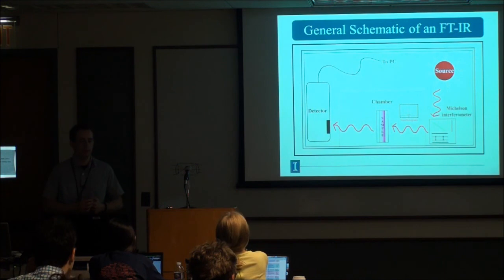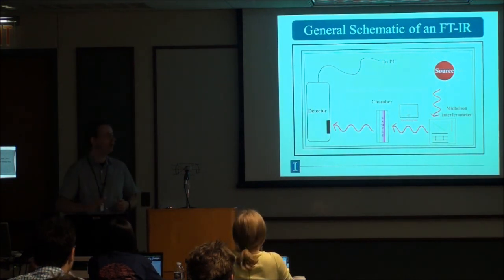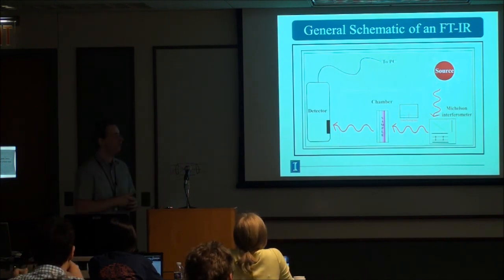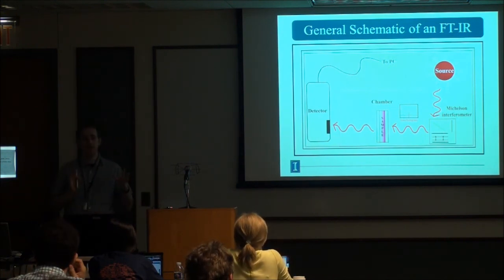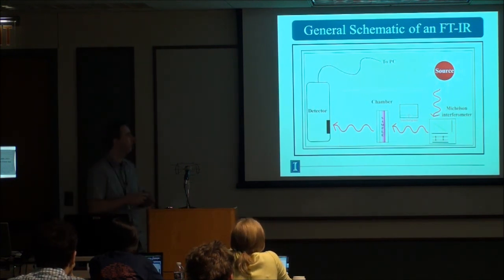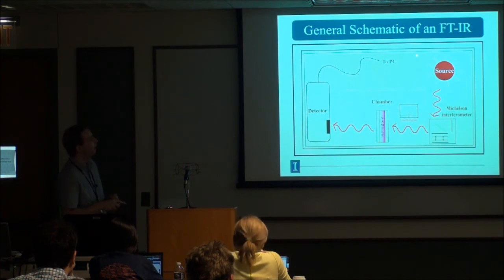So what does an FTIR look like? This is a really horrible drawing I did when I was a PhD, and I haven't changed it yet. Last week you will have seen our FTIR instrumentation downstairs. It's basically broken down into 2 components. You have the bench and you have the microscope. This is the bench. It's actually fairly simple.